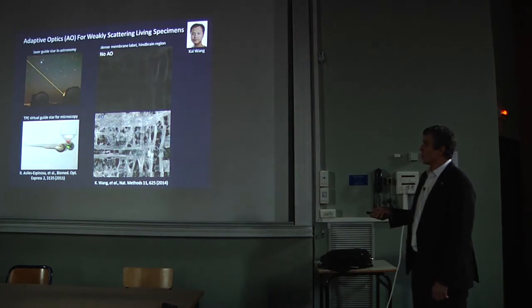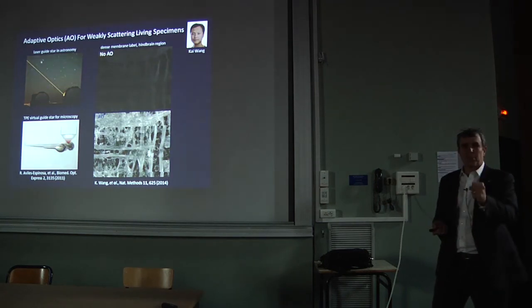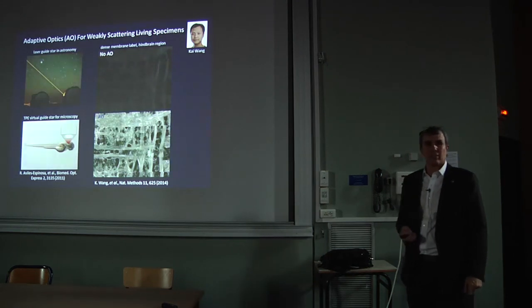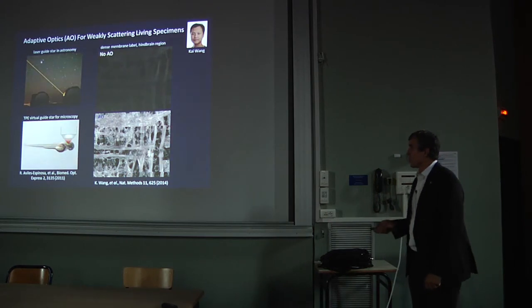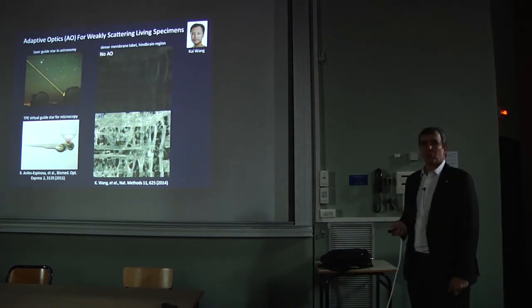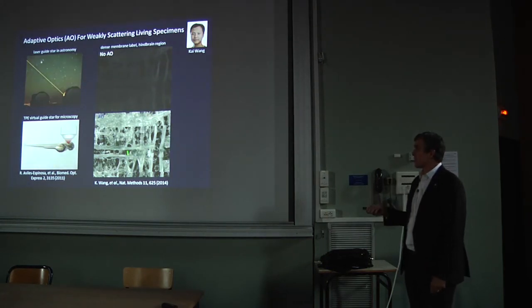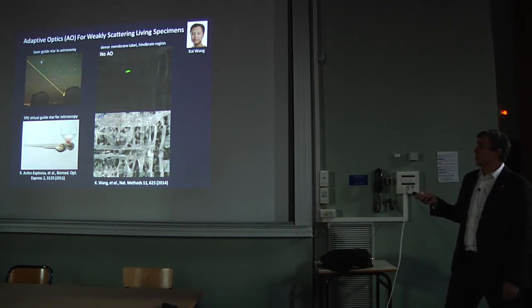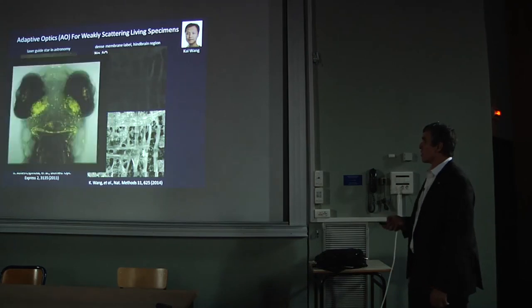A couple of years ago, a group in Spain used a two-photon microscope, which creates just a spot of light instead of a cone of light, which they could then use to create a virtual guide star. We've adopted that principle and added some other things to make this more robust, and that works very well in transparent organisms to recover diffraction-limited resolution. So here you're seeing a dense set of neurons, in this case first with the AO off, and you can see the low signal and then the recovery of the signal. And there's also a major recovery of resolution as you go through.